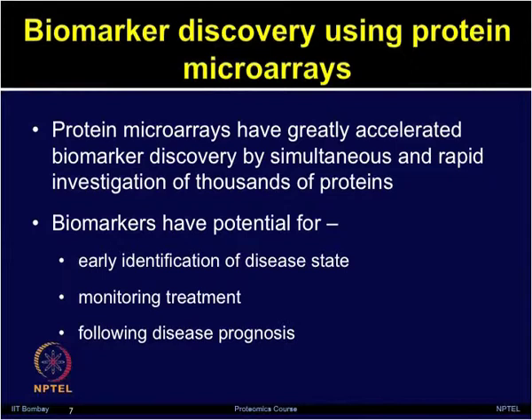Protein microarrays have greatly enhanced the biomarker discovery process because they allow a high throughput platform for simultaneous and rapid screening of thousands of proteins. Many times the clinical samples are a limiting factor because you do not have a large amount of clinical sample to perform a study. In that regard also, the protein microarray is very impressive because with a few microliters of sample, one can screen thousands of protein features simultaneously on the same platform. So, biomarkers have potential for early identification of disease state, monitoring disease treatment response, as well as follow-up on the disease prognosis.